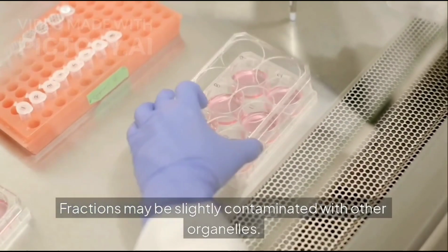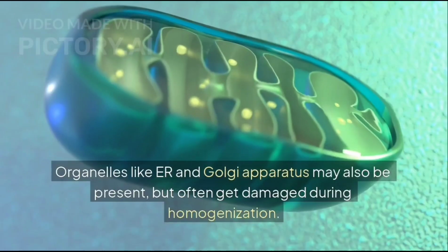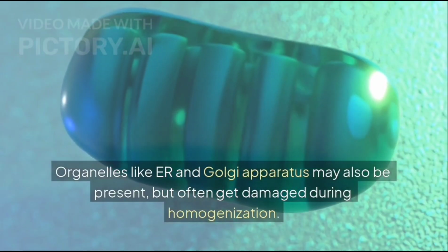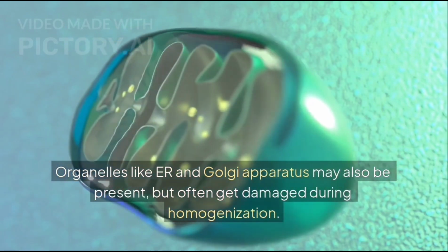Complete separation is difficult because: number 1, fractions may be slightly contaminated with other cell organelles. Number 2, organelles like endoplasmic reticulum and Golgi apparatus may also be present but often get damaged during homogenization.